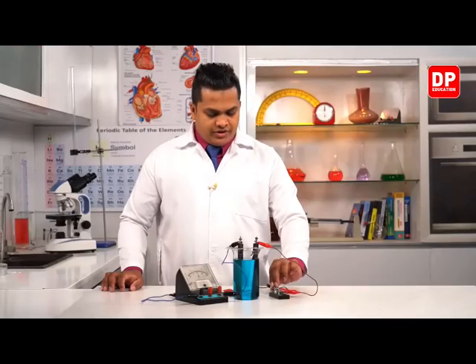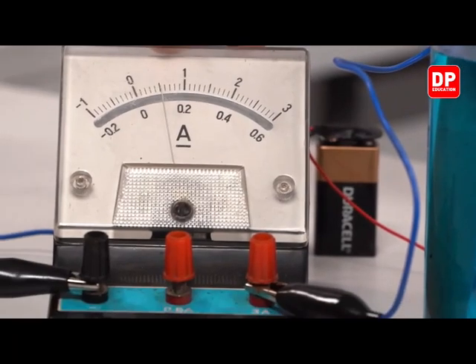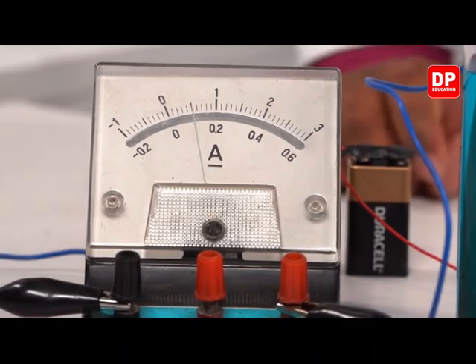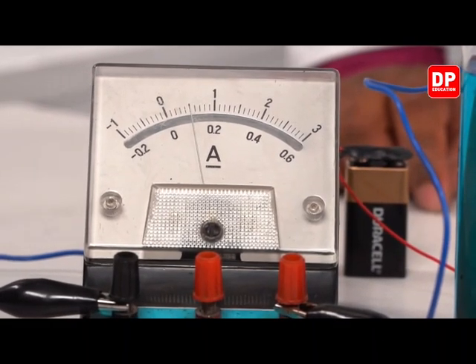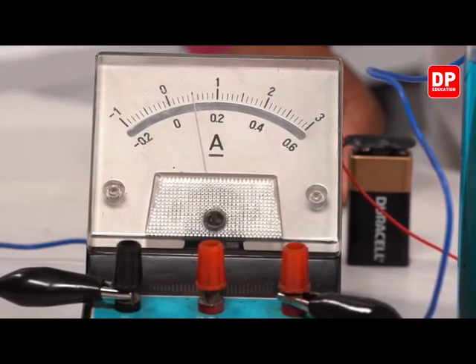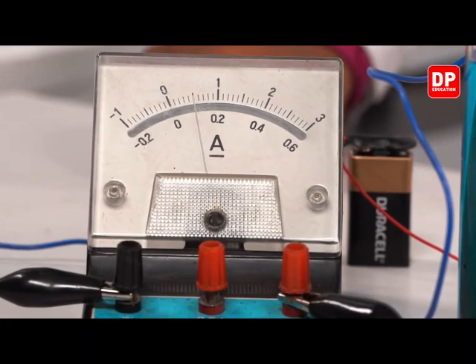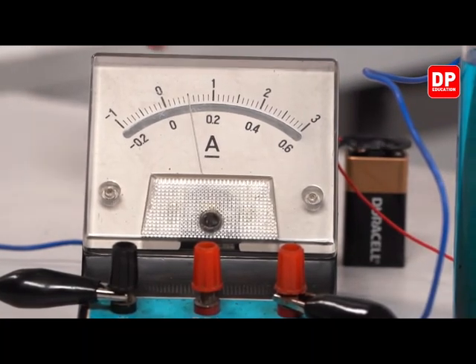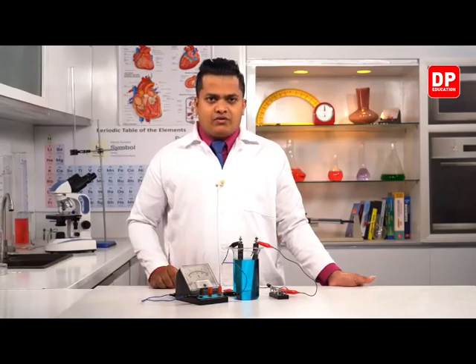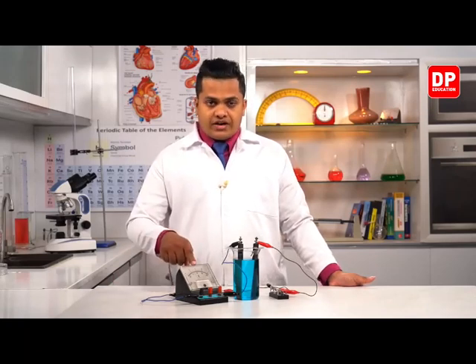So here we go. I'm going to turn on the switch. As you can see here, as soon as I turn on the switch, there's a clear deflection in the ammeter. The ammeter reading was 0 and now, connected to the 3 ampere terminal, it's showing around 0.5. The reading is actually not that important. As you can see here, some electricity is flowing through the ammeter. That's why it is showing a reading. So it's around 0.5 right now.